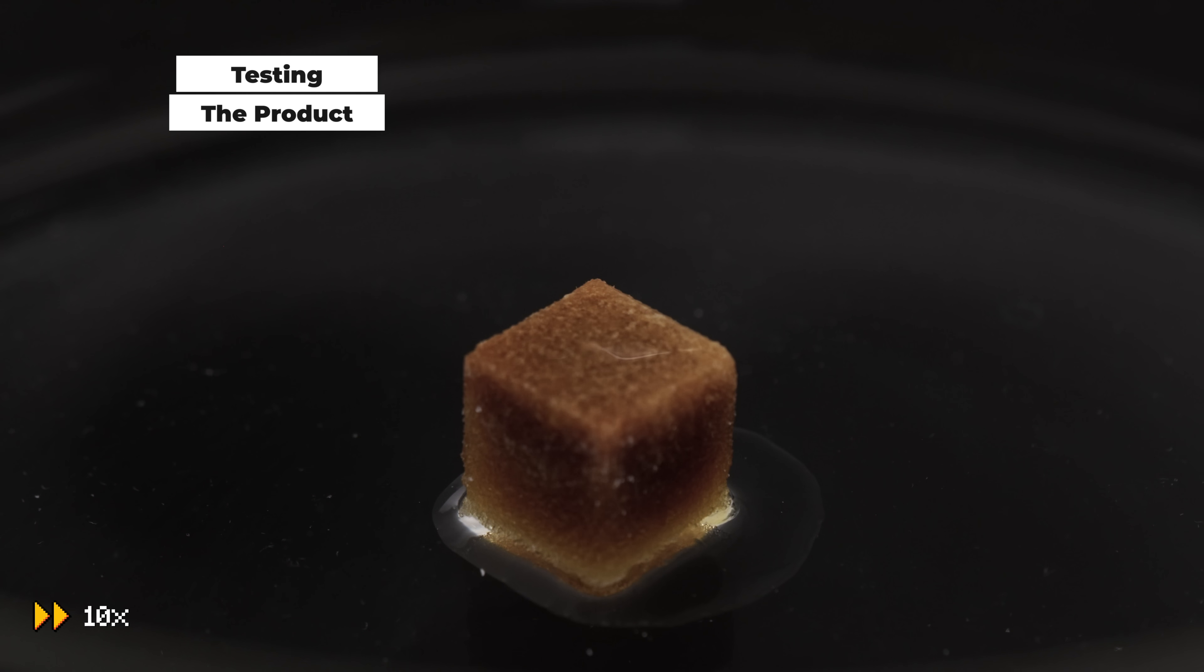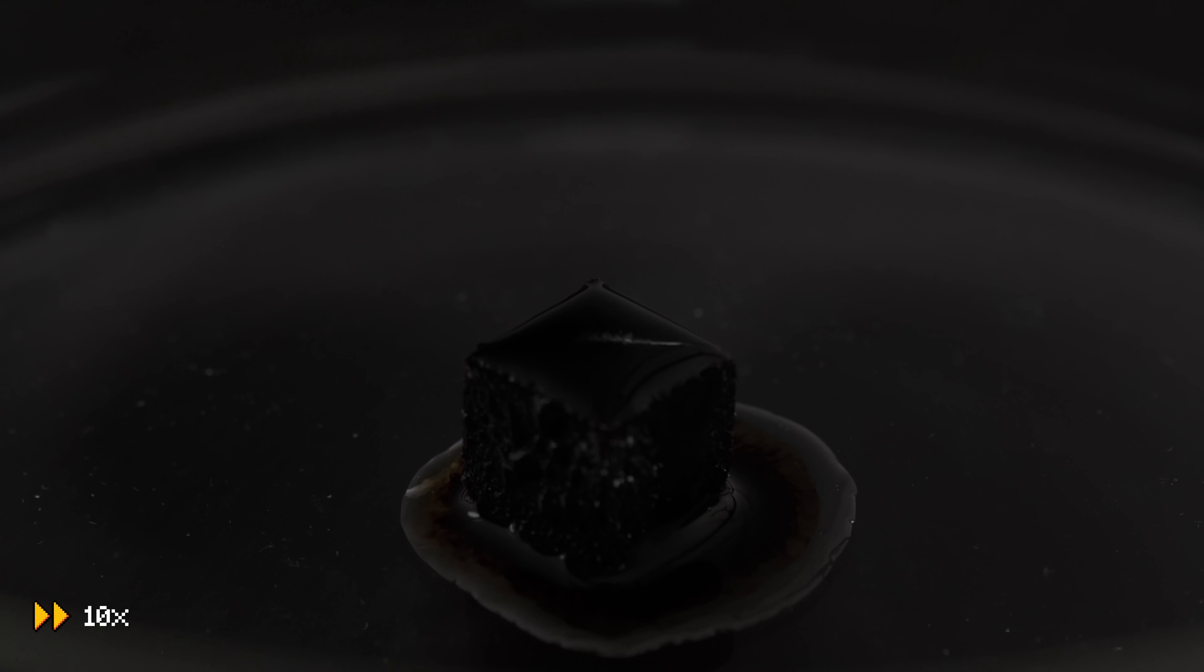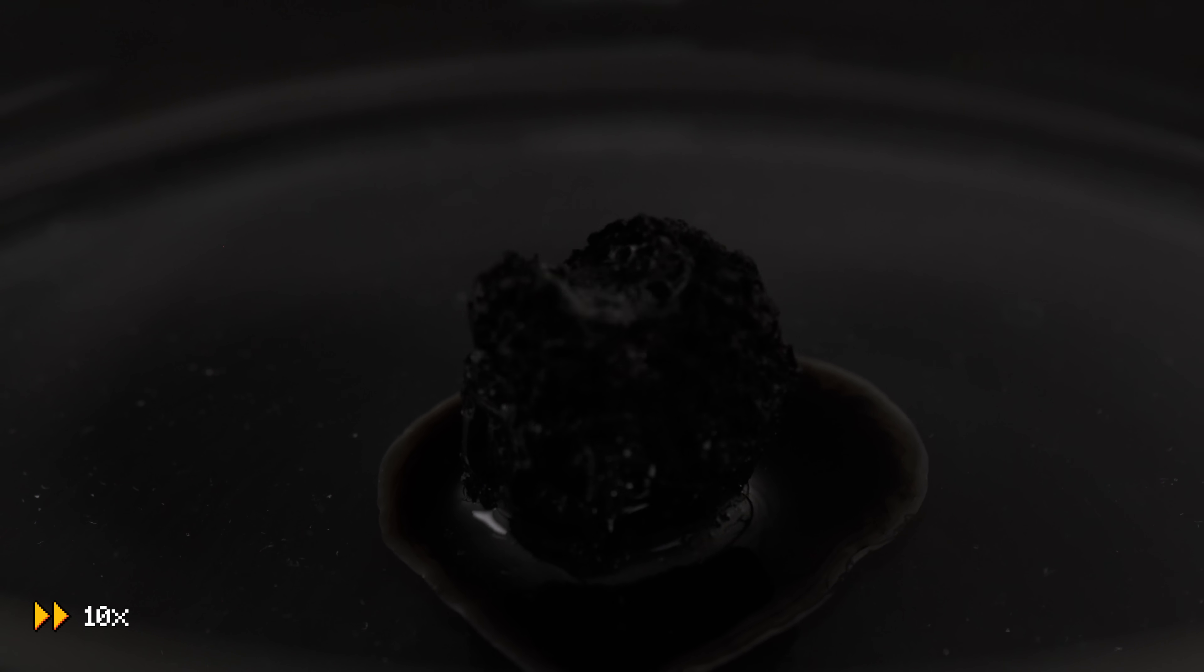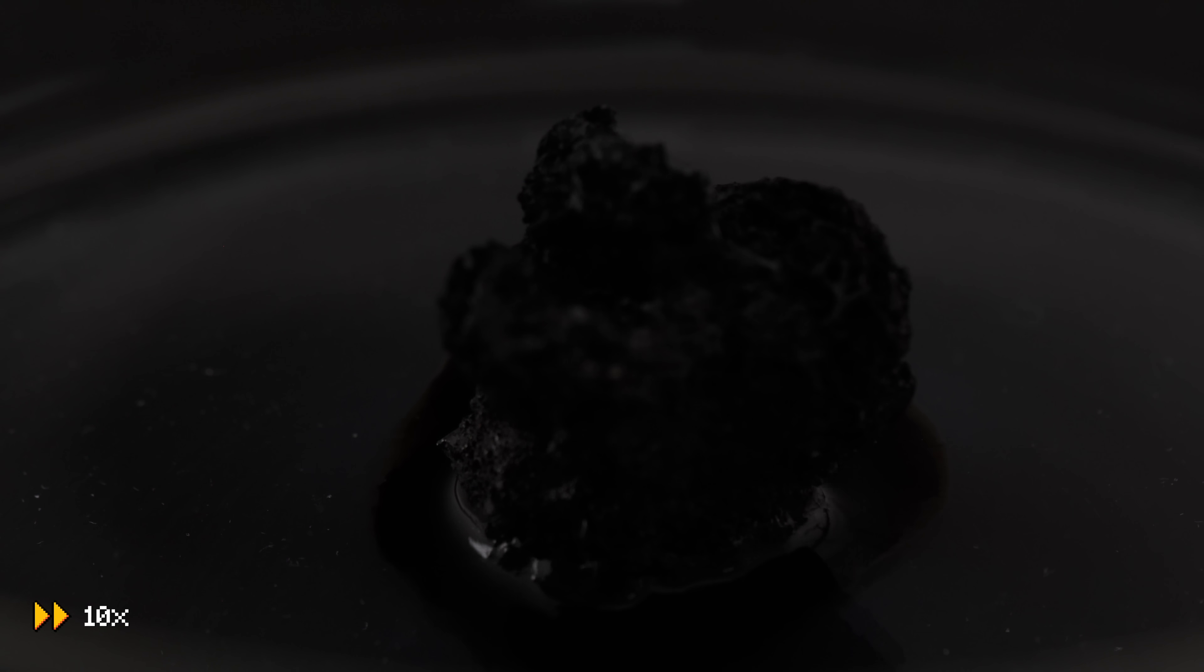Concentrated sulfuric acid is very well known for its dehydration property. To test the product you just collected, simply drop a few drops to a sugar cube. The sugar cube will soon start to turn brown then black, releasing heat and water vapor, eventually dehydrated to a black piece of carbon.